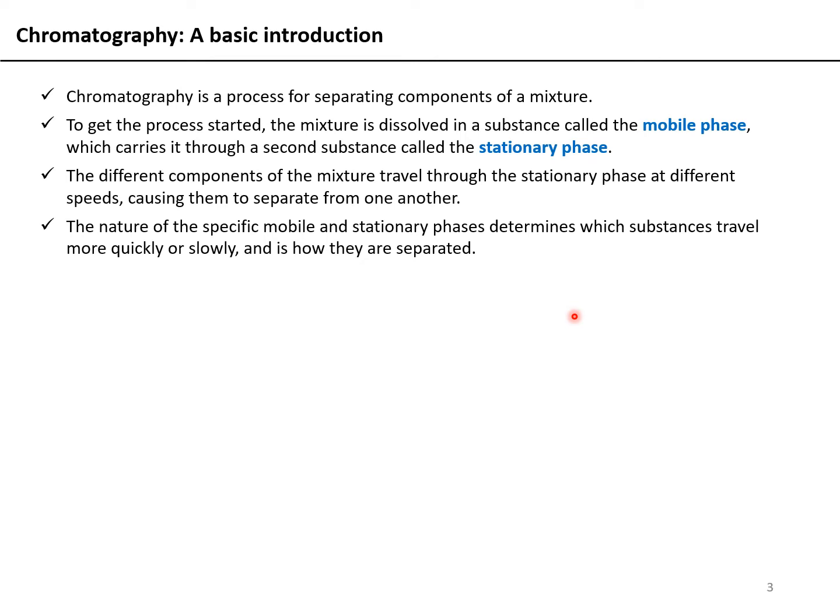Depending on what kind of chromatography you're performing, the deciding factor for this migration rate will vary, and this differential migration separates out the proteins. These different travel times are referred to as the retention time. The longer the retention time, the later the protein will elute or come out of the column or of the beads or the stationary phase.